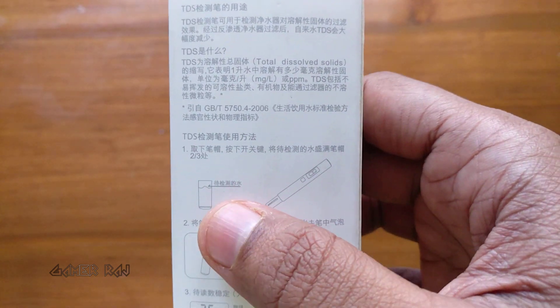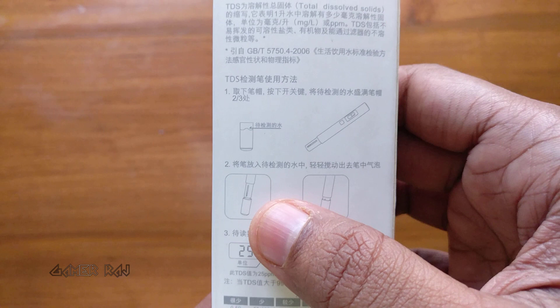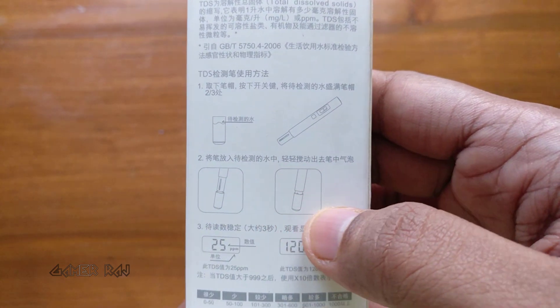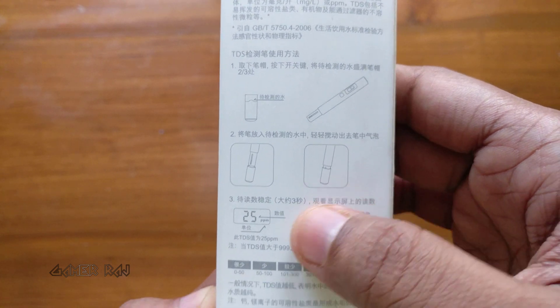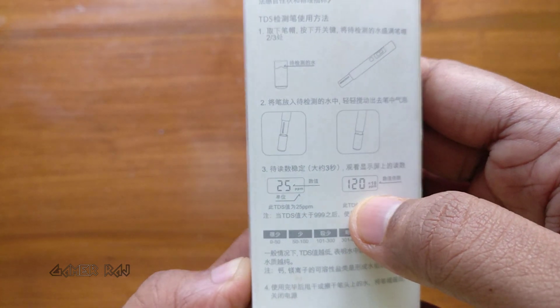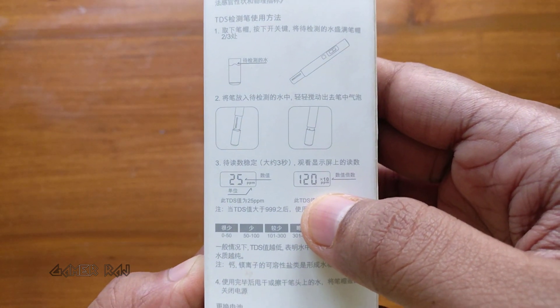To measure, take the solution in the tester cap or in a small container. Now dip the tester probe gently, wait for 3 seconds. The measurement will be shown in ppm.